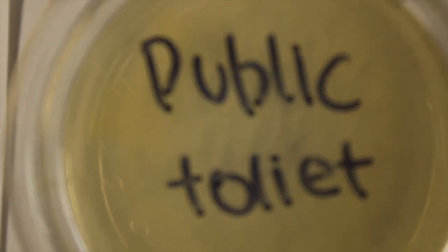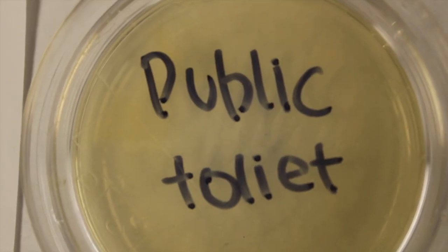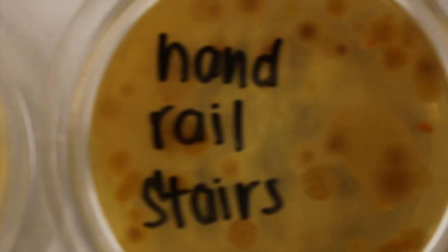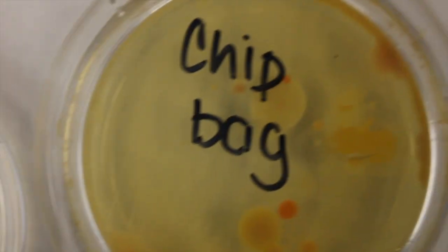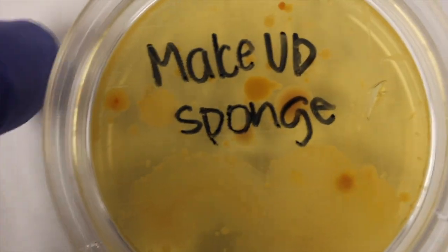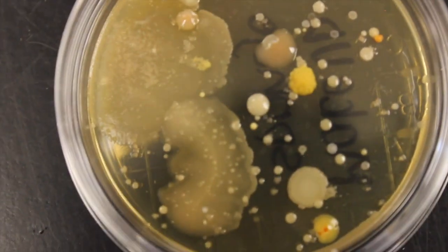We have here contact plates where we incubated them for 48 hours from a public toilet, the palm of your hand, a handrail on stairs, a can, computer mouse, yoga mat, elevator button, chip bag, and makeup sponge. Now we're going to look at each one of these here. I'm going to pull this over. We can look at our makeup sponge.